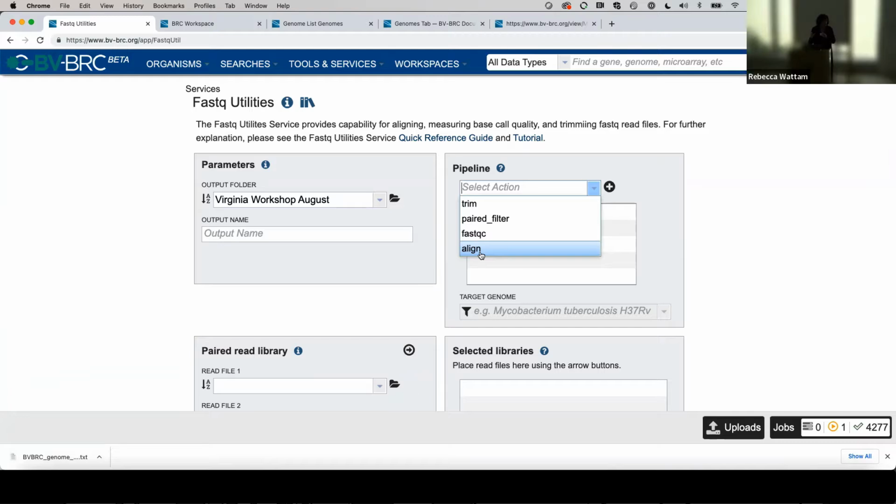If you know, you can map it to a reference genome, and at the end, we'll be showing you RNA-seq, a dual RNA-seq, where I have first used this to align the reads to the bacterium and also to the host genome. And then I do the RNA-seq to that. And it just makes things so much cleaner and categorized. It's awesome. And you can do any combination of these together, but I am a purist. I only like to do things one at a time. I don't want a messy job report, so I do one thing at a time.